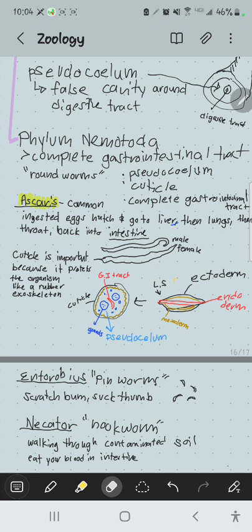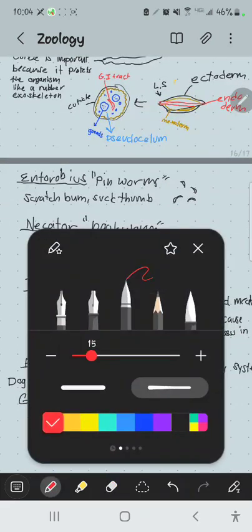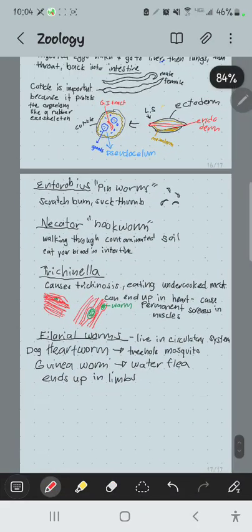So I don't have any guinea worms, I don't have elephantiasis, but I do have a heartworm. And so you will have to know that this is a nematode. It's transmitted by a mosquito. You don't have to tell me how to treat it, but basically it's a filarial worm parasite of dogs and cats. We good? Okay. All right. So that's all of our nematodes here.